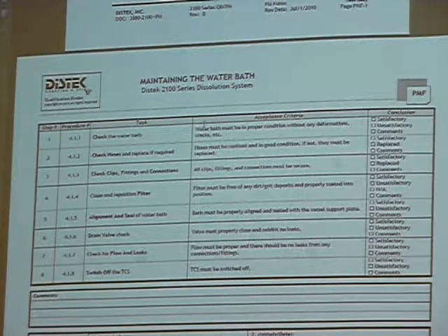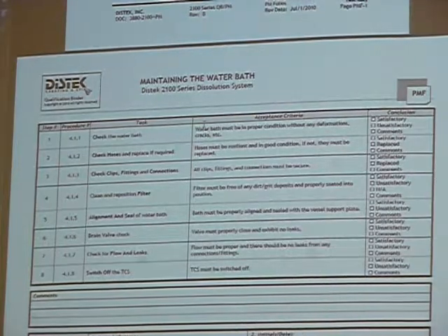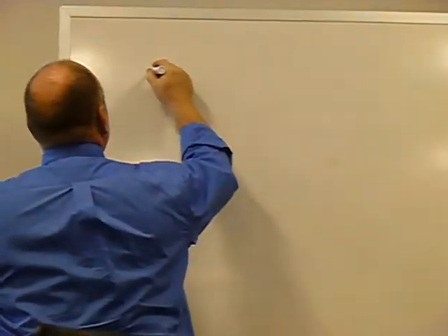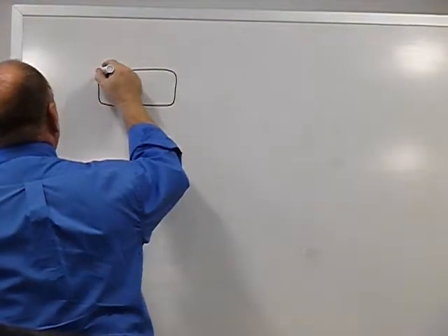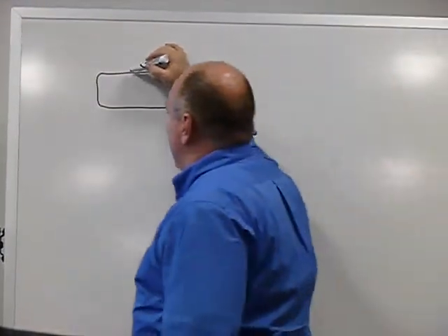When it starts to get wider, it has a tendency to pull down, looking down at it.